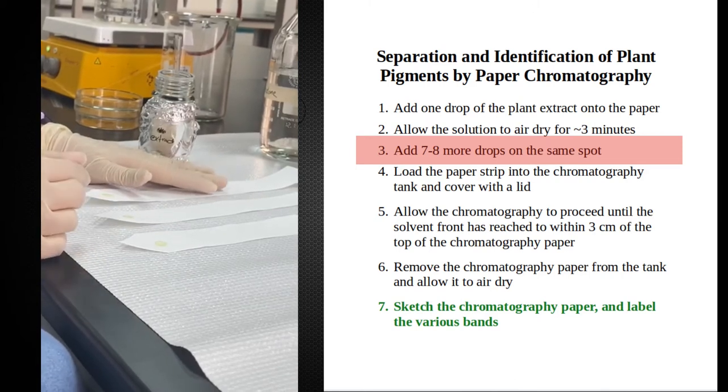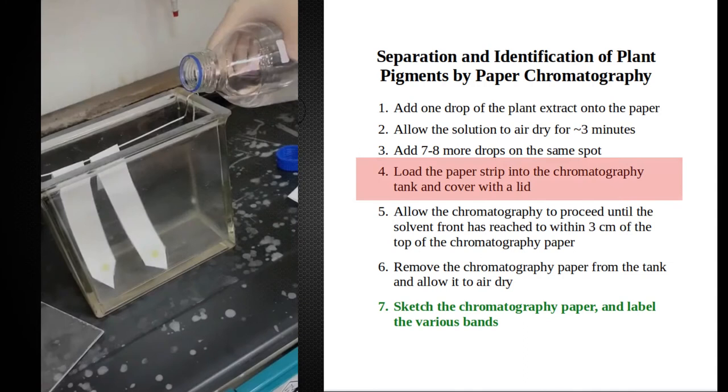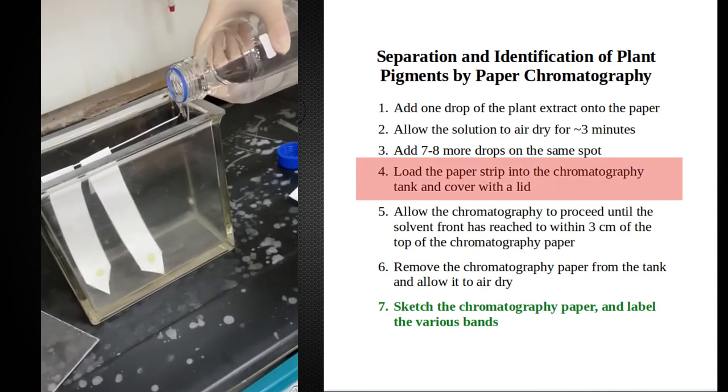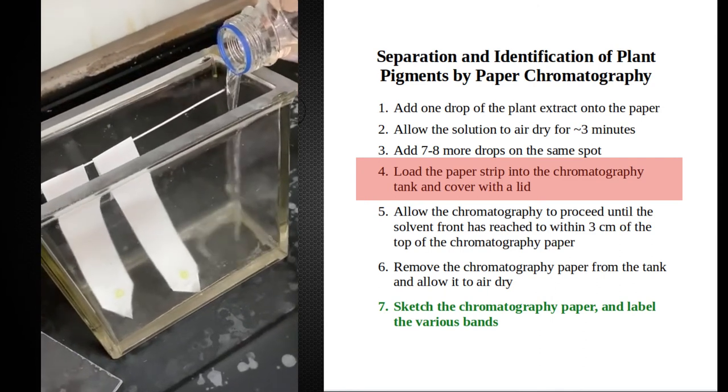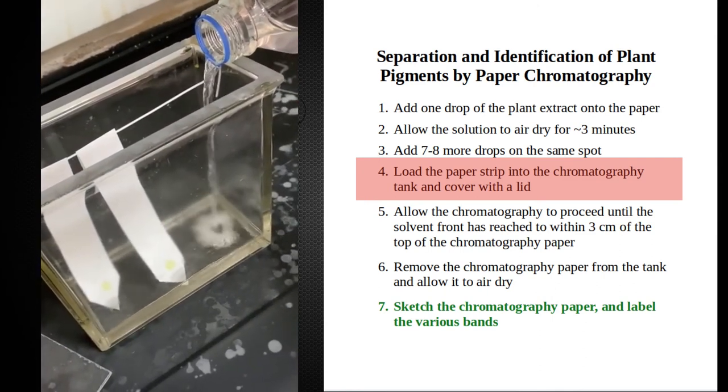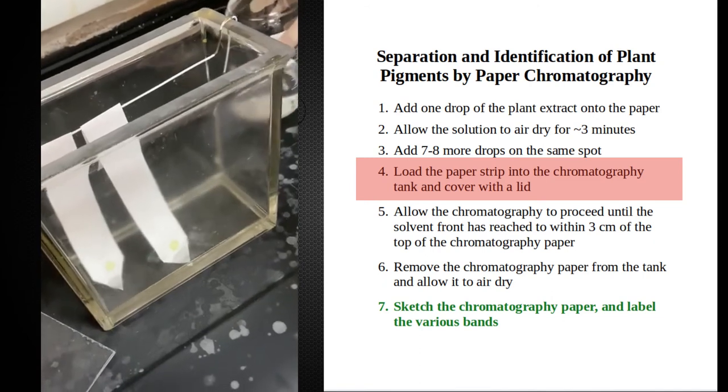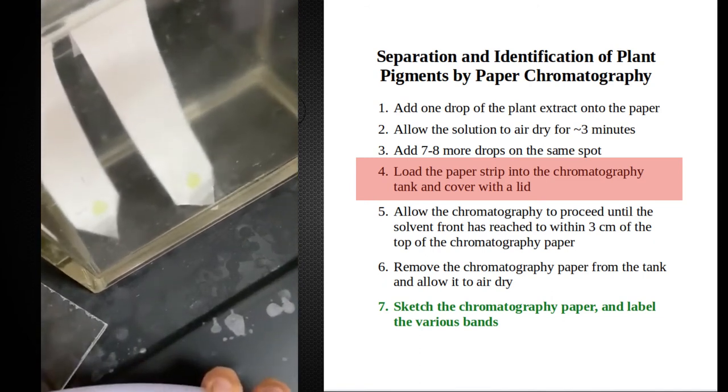So this is the acetone and petroleum ether, that's enough. And this is the third paper.